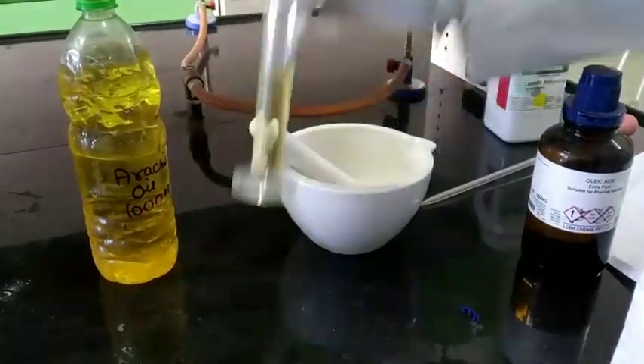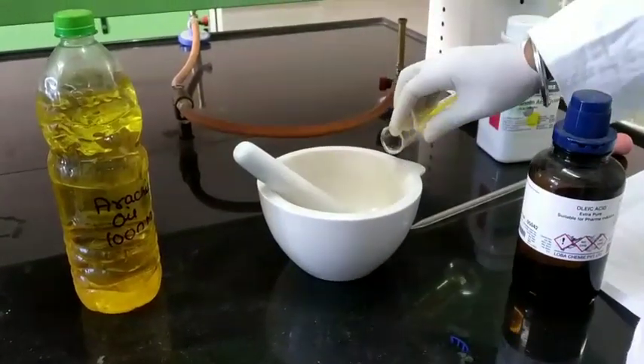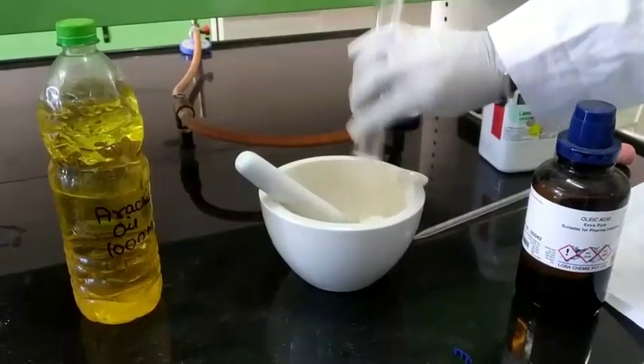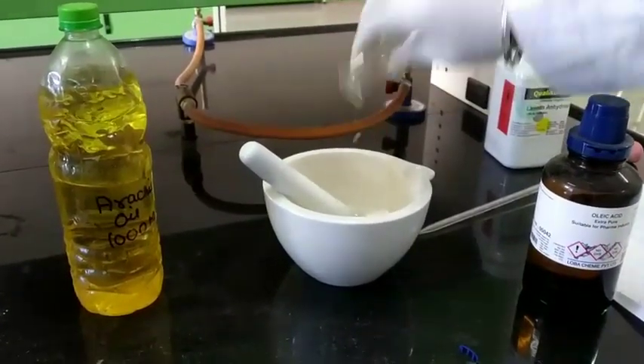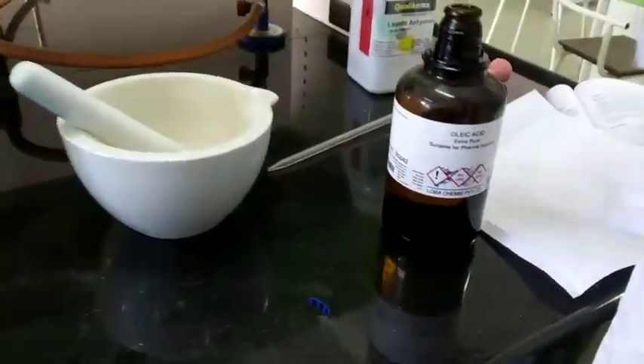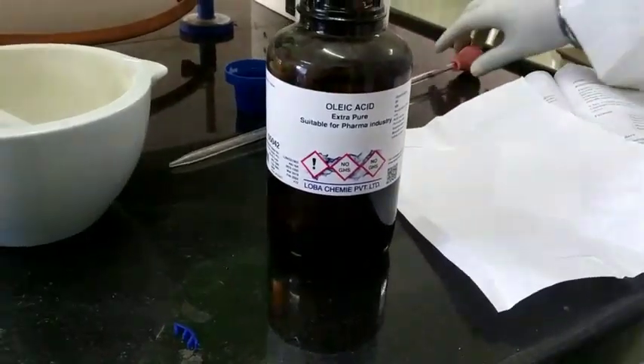Mix the weighted quantity of arachid oil which is 32 ml and 0.5 ml of oleic acid.